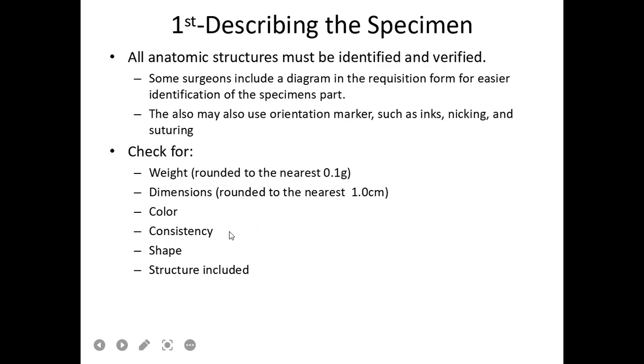Consistency. So, of course, for you to know the consistency of the specimen, you need to touch it. Because sometimes, the students nandidiri sila sa specimen. So, hindi po pwede. So, how will you know the consistency? Under the consistency, pwede siyang firm, soft, hard, or pwede rin meron siyang rough structure, depending on the specimen. Shape, is that round, oval, or the specimen have an irregular shape?